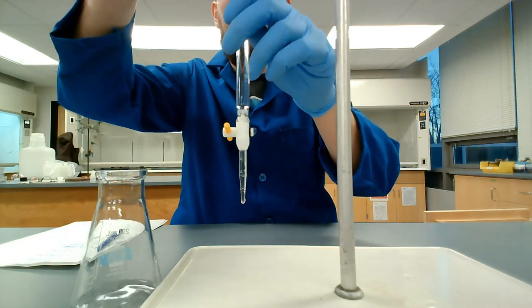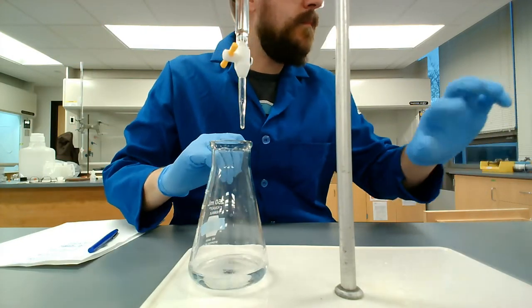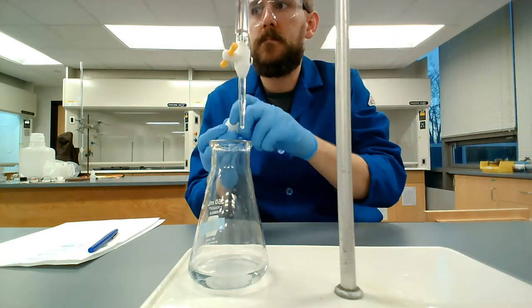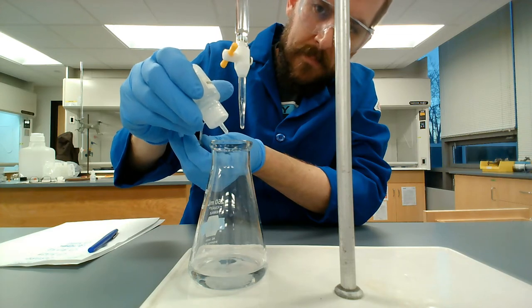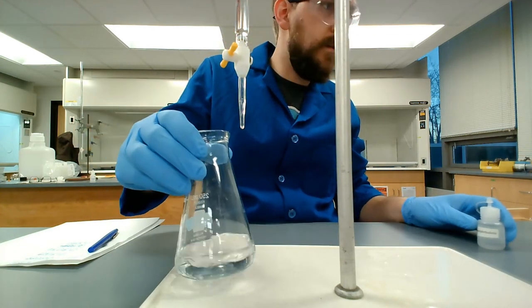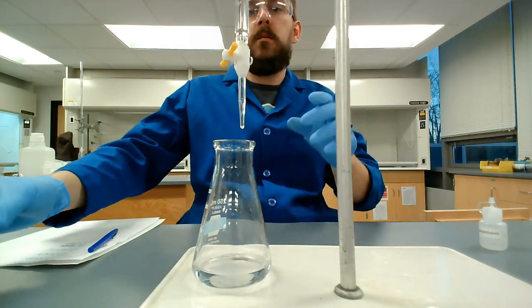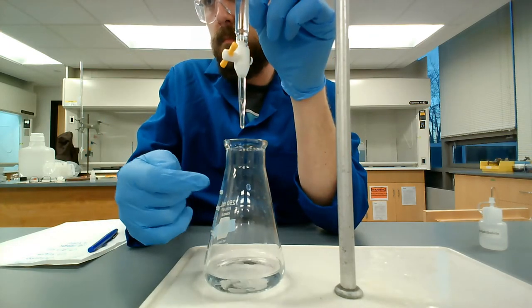Here is an Erlenmeyer flask that has a bit of our oxalic acid solution in it. I'm going to put in my phenolphthalein indicator now. I like to add my indicator right before I start a titration. That way I don't second guess myself, wondering, hey, did I add it or not? I know it's there. I did it. Because when using phenolphthalein, if I didn't just drop these two drops in, there's no way for me to tell that they're in there or not.